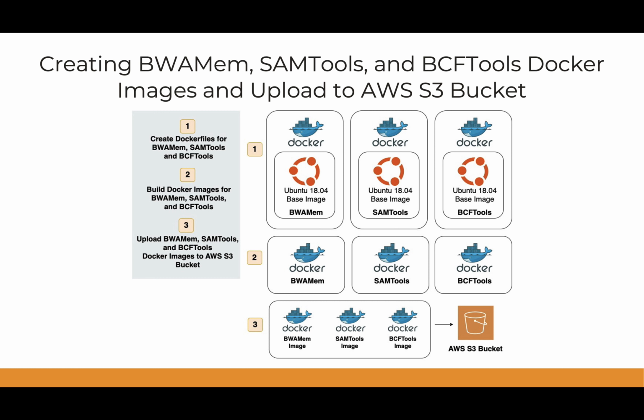Now, with a better understanding of our tools, we'll create Docker images from these Docker files. These images will be uploaded to the AWS S3 Bucket, setting the stage for our subsequent steps in the genomic analysis.